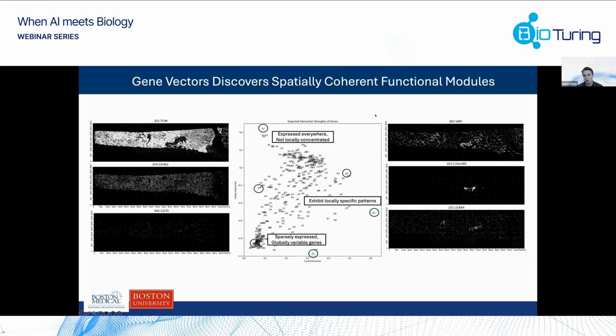There are already some 3D analyses implemented, including spatial expression detection. All of that is implemented in 3D. I think we have an example where we did this in the original data set from MERFISH, where they have a 3D data set on an area in the mouse brain. So if you go to the examples on our website, you can see how it works and what you can do with it.